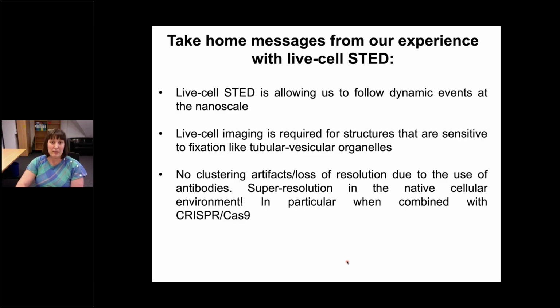So this was my last example. Maybe I didn't get a lot of the biology across, but I really hope I convinced you that live-cell STED is now allowing us to follow dynamic events at the nanoscale, like communication between organelles, membrane organization, and nanoscale localization of membrane proteins. Live-cell imaging is really required for structures that are sensitive to fixation, for example tubulovesicular organelles.